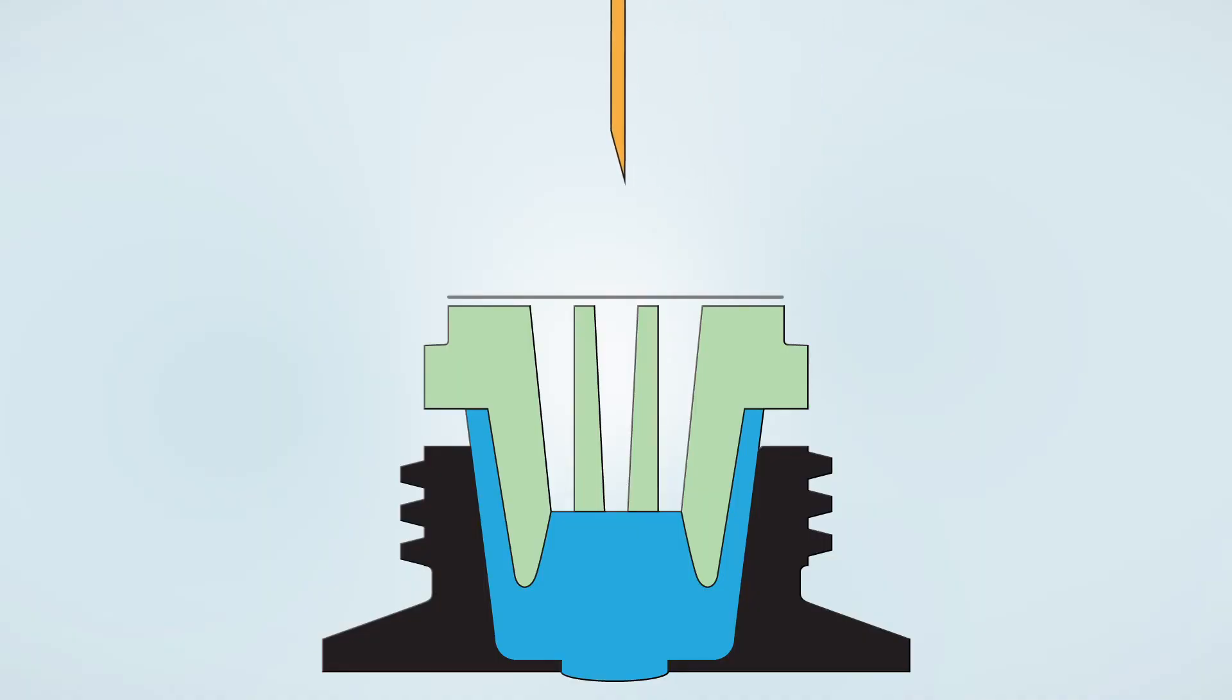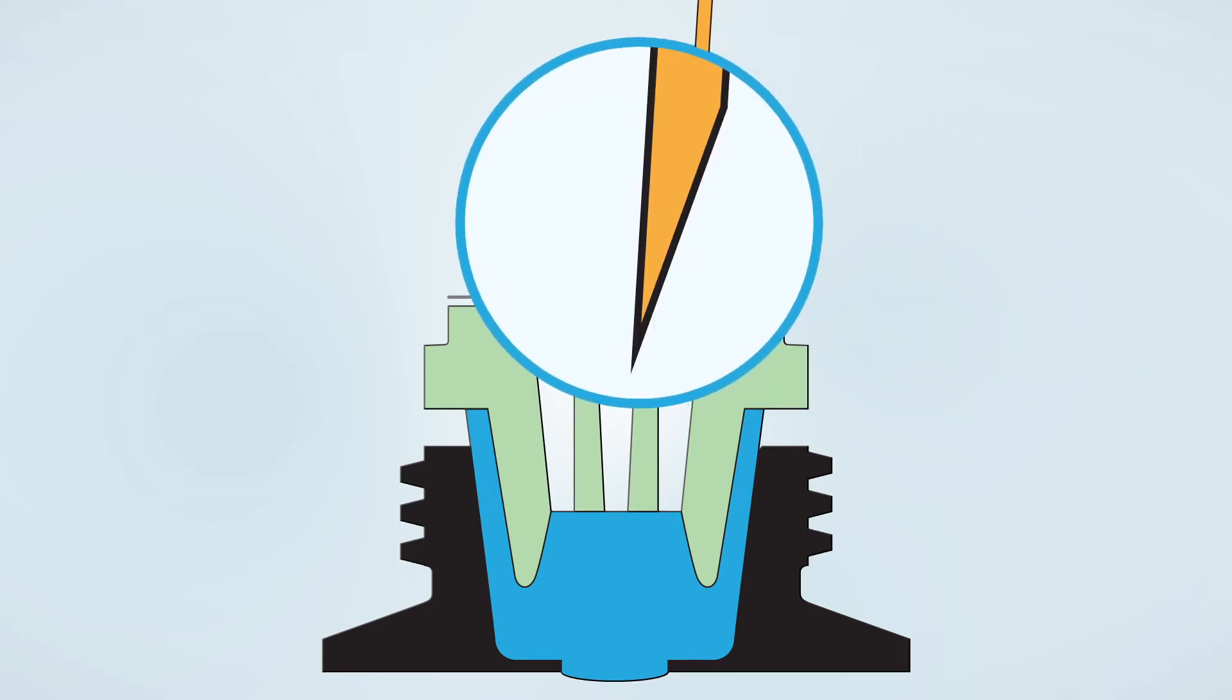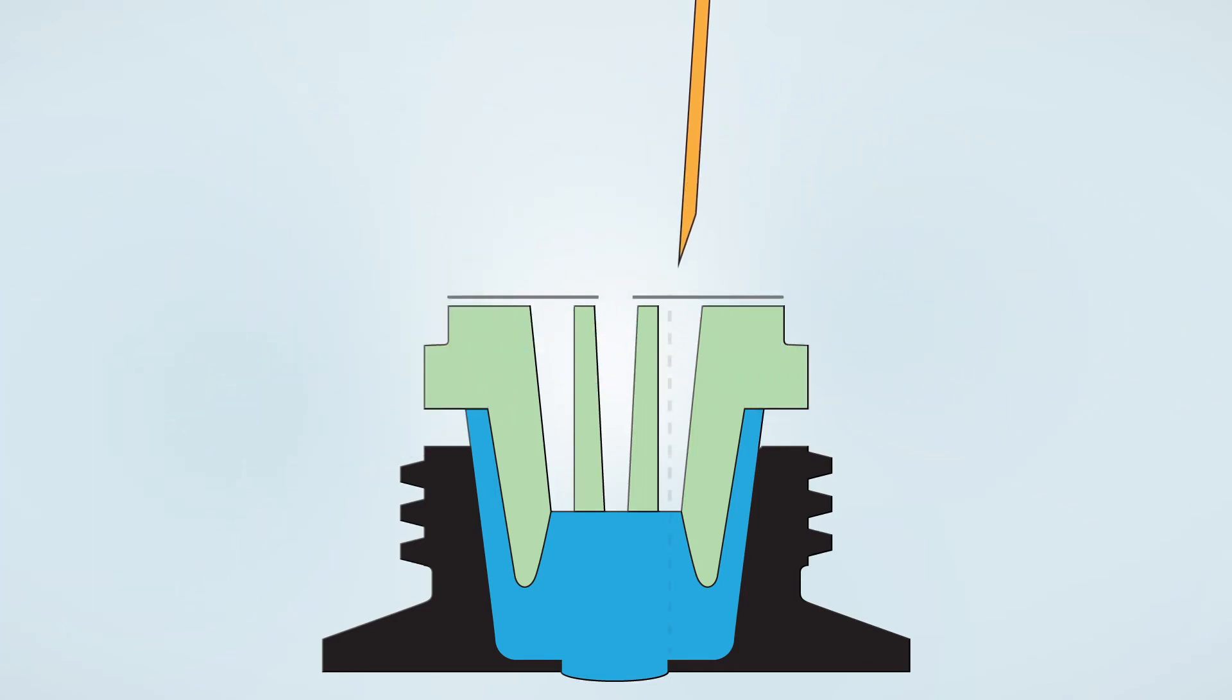When inserting the needle into the center channel, push the needle straight in. The remaining needle channels are slightly slanted toward the center. Turn the bevel of the needle outward. When using the outer channels, push the needle in at a slight angle as indicated by their position on the septum.